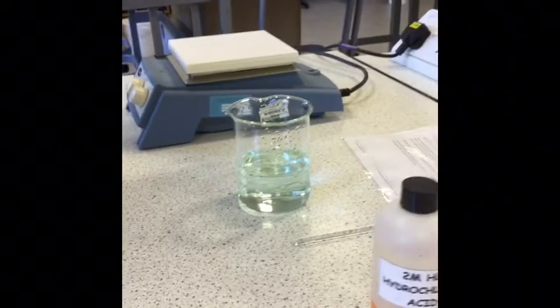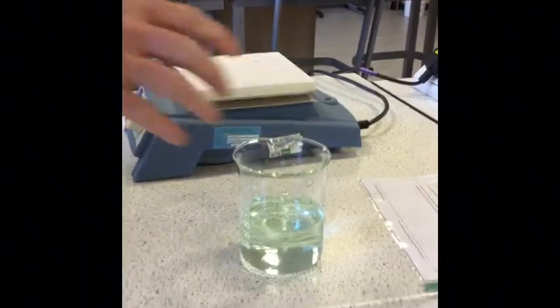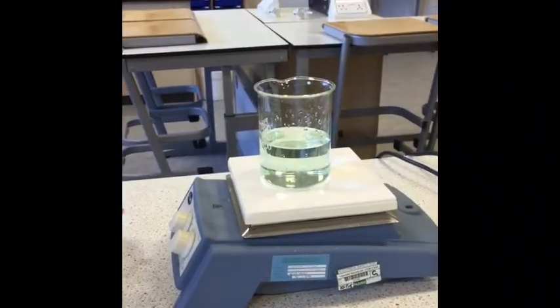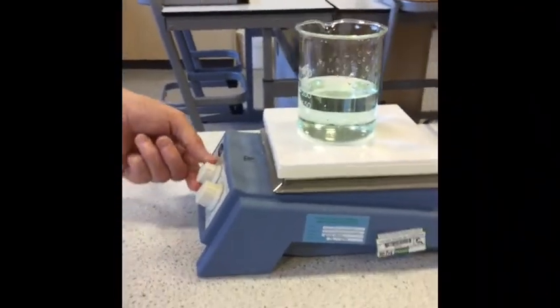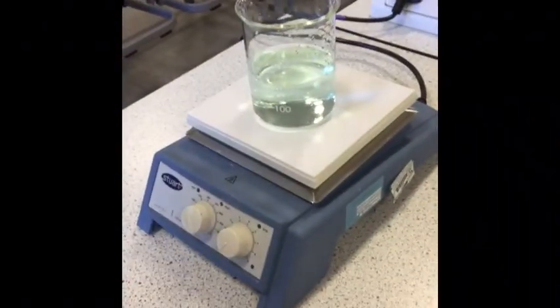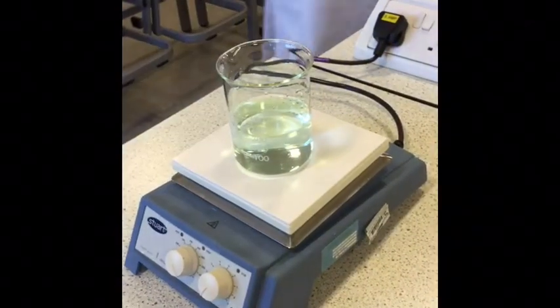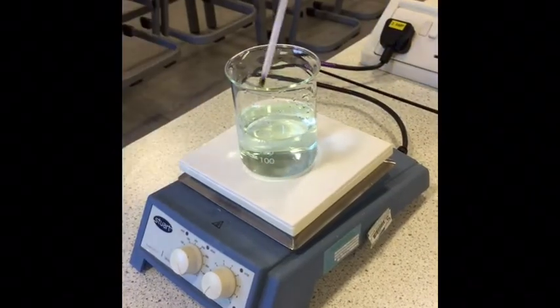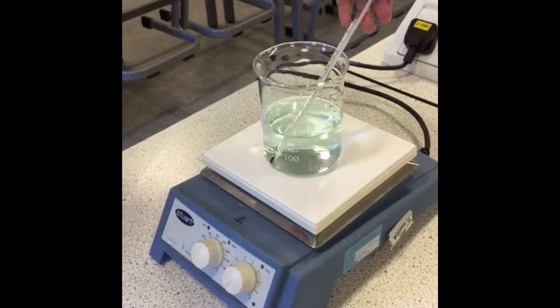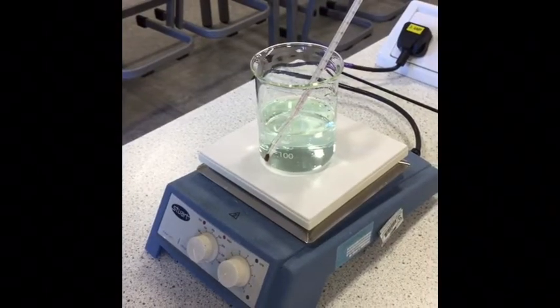Okay, and now we have to heat the solution to 70 to 80 degrees on a hot plate. So we'll put it on a hot plate and we'll turn it up. I'm going to turn it up to about the maximum temperature just for a wee while to get up to about 50, then I'll turn it down a bit. So I'll just get a thermometer, put it in, and I'll just leave it at maximum until we get to about 50 degrees, then I'll start to turn it down a wee bit just to get it to settle in between 70 or 80.